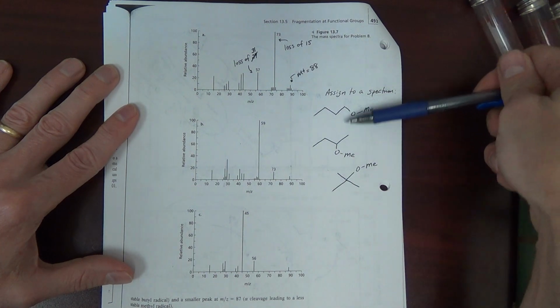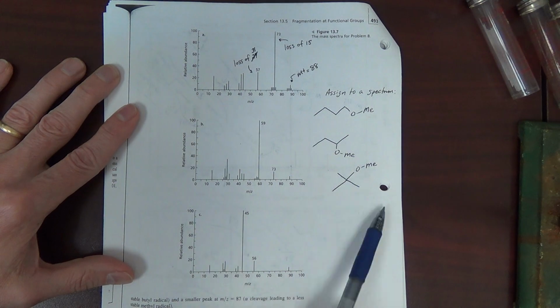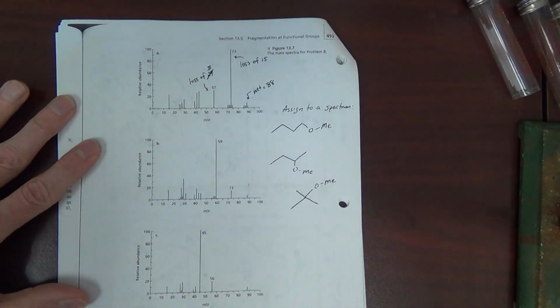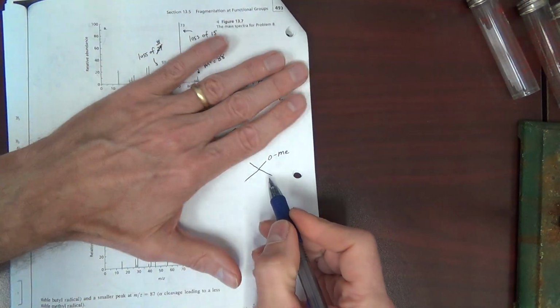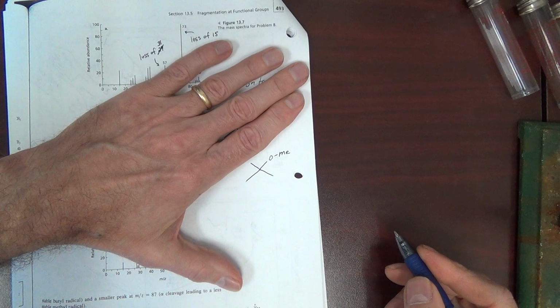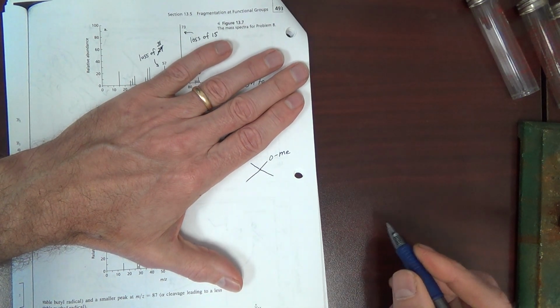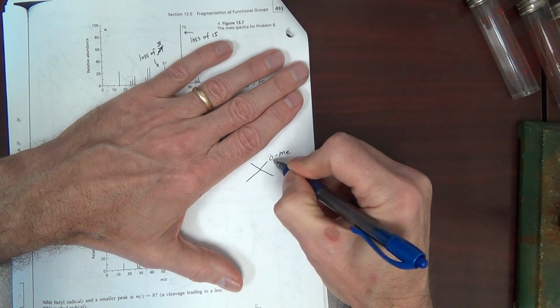Or if there's 10 compounds, you just assign each mass spec to a compound. Okay, how you want to do this? I recommend you start by looking at a compound and saying, okay, what do I expect here? For example, you might expect to cleave here to make a cation there next to a lone pair.